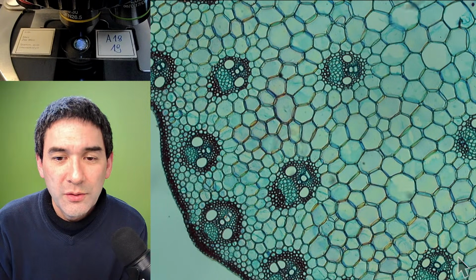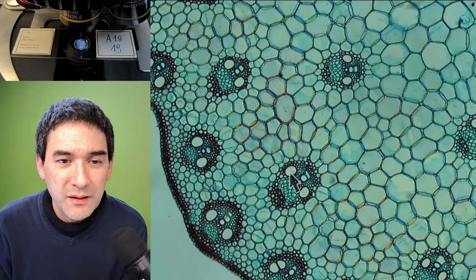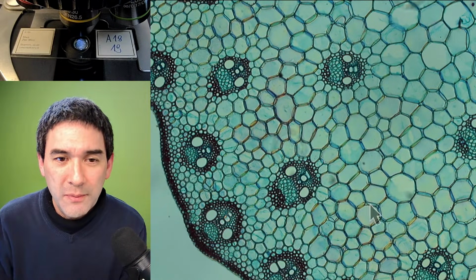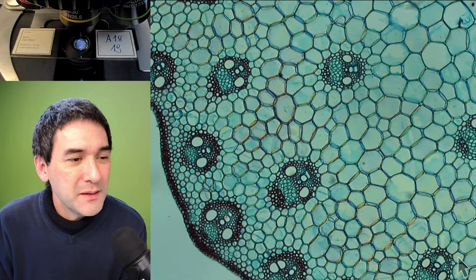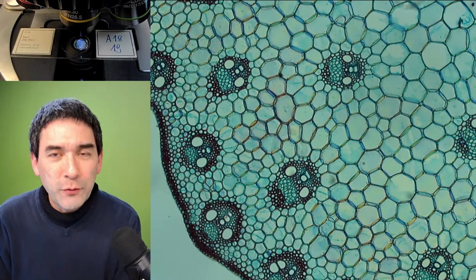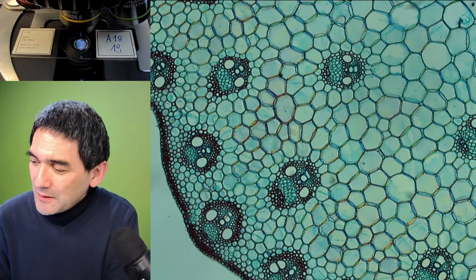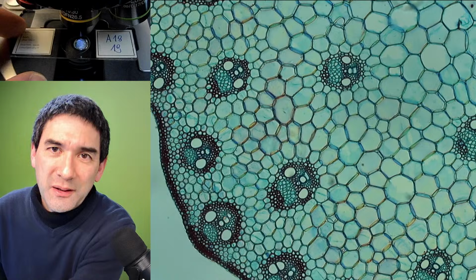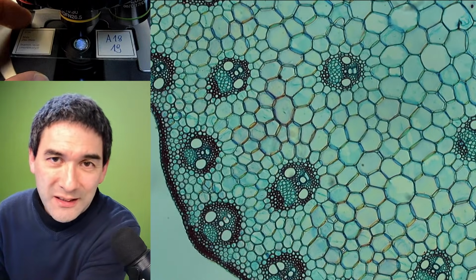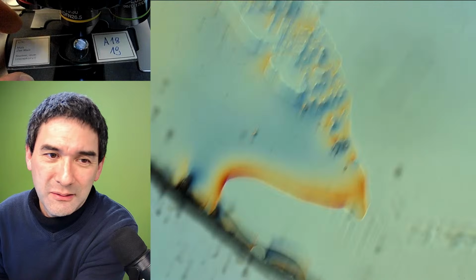Those are the vascular bundles, and those large cells in the middle are the xylem again, the tissue that transports water up the plant. Of course, there's always a little bit of biology involved, and sometimes it's nice to know and understand a little bit of what you see. But sometimes it's simply just cool to look at.